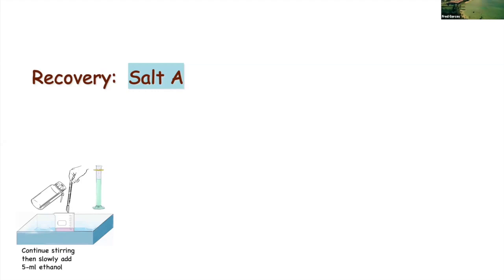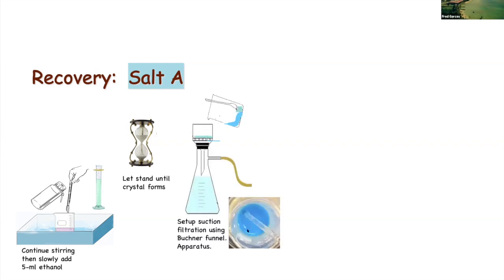Absolute ethanol means it's pure ethanol, no water in it. I let it sit in the ice bath for a while until it crystallizes. This is what my product looked like. This is the beaker headshot.